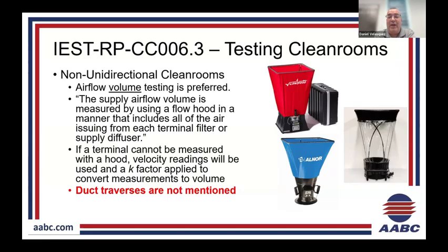So it is preferred. Make sure that the hood skirt fits over the entire filter. I've gotten customers in the past because their previous vendor went through with a 2x2 hood to try and read 2x4 filters. Anybody that does a lot of work in clean rooms nowadays knows that anytime you're in a clean room, you're on camera. So the customer saw their certifier doing this because that guy didn't want to walk out to his truck to get his hood.